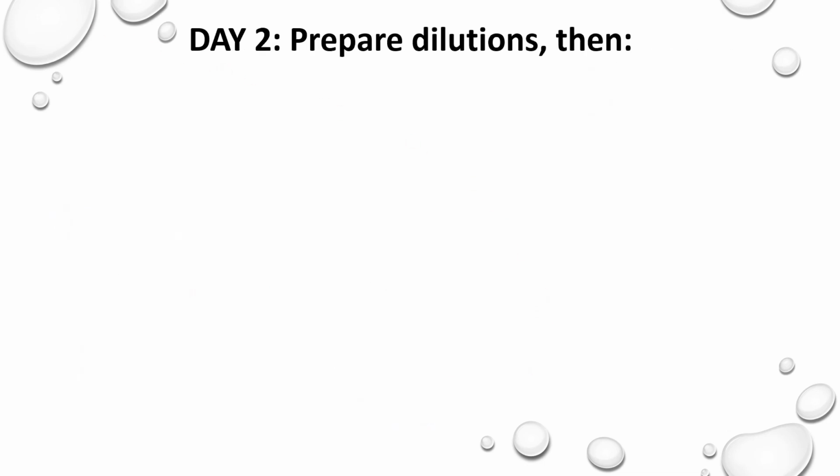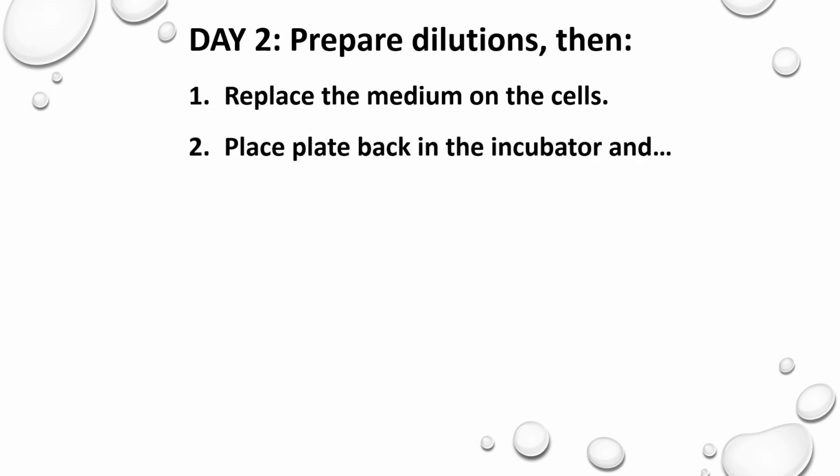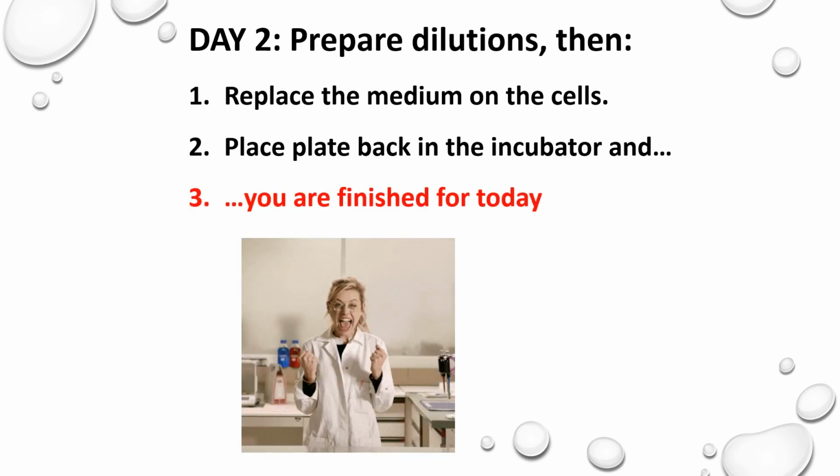So enough talking, go and prepare those dilutions. Replace the medium on the cells with your new dilutions, which is always fun to do with the vacuum, because the sound it makes really reminds me of going to the dentist, which actually is maybe not that funny, but okay. Place the plate back in the incubator, and guess what? You are finished for today.